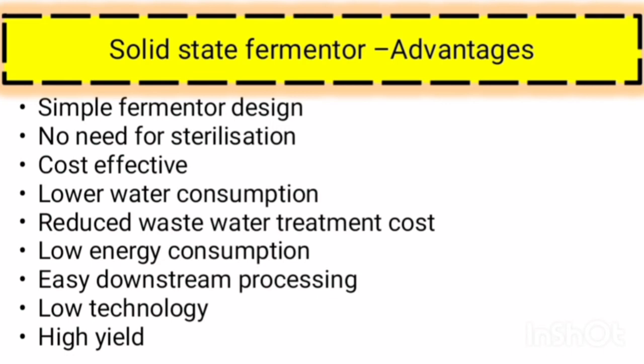Solid state fermentations have certain limitations also. There is no precise monitoring of the fermentation. That is, oxygen level, carbon dioxide level, moisture content, etc. cannot be monitored. Okay.